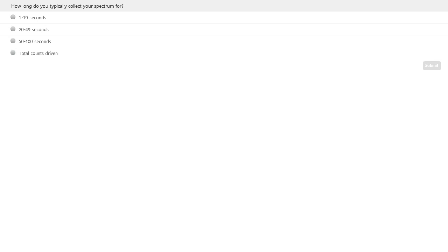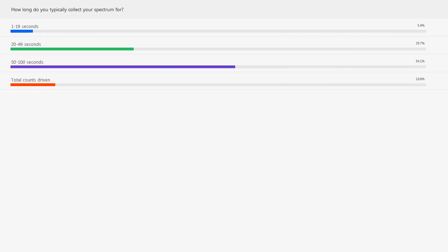I'll move along. Okay, so we see a lot of people collecting for 50 to 100 seconds. Over 50% of you are collecting for a good amount of time, a lengthy amount of time. That does go hand in hand with the traditional microanalysis approach, especially for SiLi detectors. So certainly there are probably some SiLi detector users out there. Probably the quicker collection, the 30% that we have for the 20 to 50 seconds, those are probably some of our silicon drift detector users.